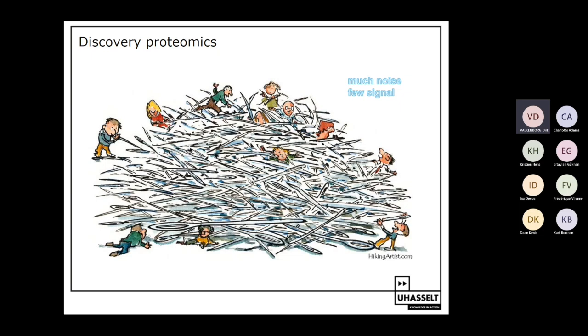That means that we will analyze a sample of a patient or a plant or any organism, and we will try to identify and quantify as many proteins as possible that are present in that sample. And we will try to do that with mass spectrometry. So discovery proteomics is the topic of this series.